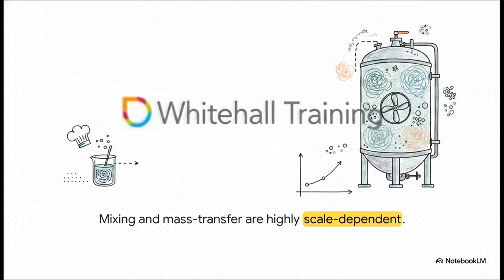Mixing and mass transfer effects are highly scale dependent. As your equipment gets bigger, the fundamental physics literally change. LNP formation, for example, is incredibly sensitive to scale. And when you're looking at viral vector culture or mRNA synthesis, things like mixing uniformity and oxygen transfer behave completely differently in a 2,000-liter bioreactor compared to a tiny little lab flask. You really have to rely on targeted engineering studies and scaled-down models, not just linear assumptions.